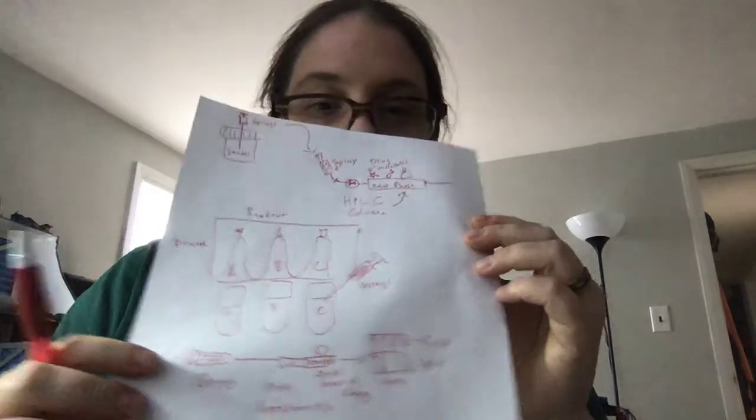But in this case, we'll say that my sample was really pure, so we only have one molecule that's going to fly right through. And what's going to happen from this is that I'm going to get a mass.